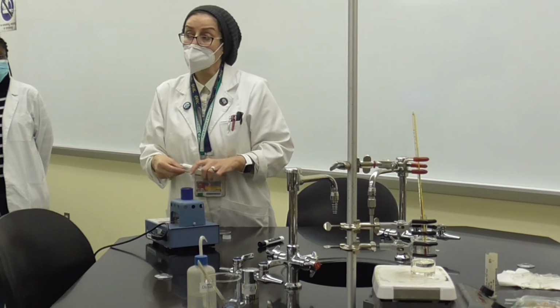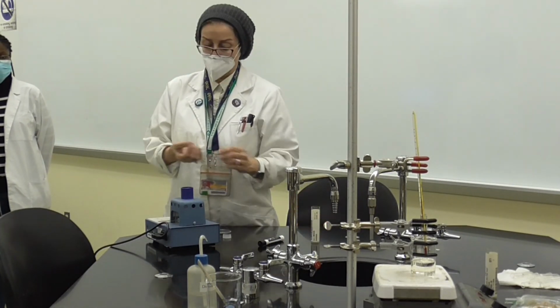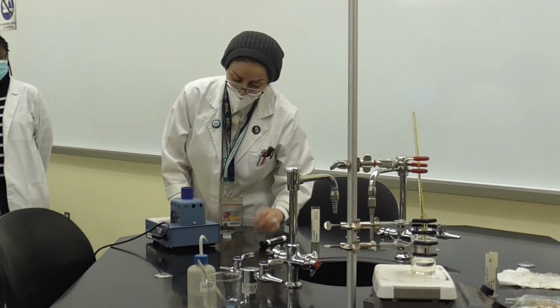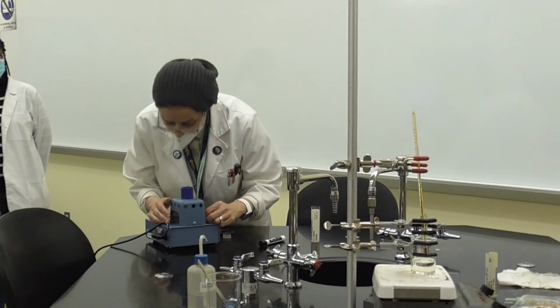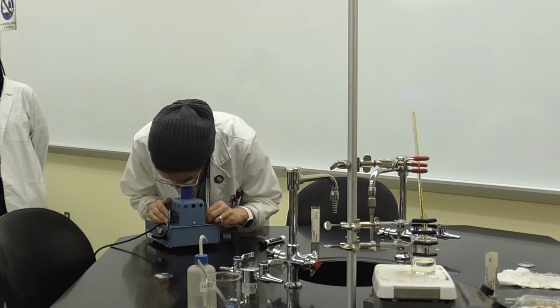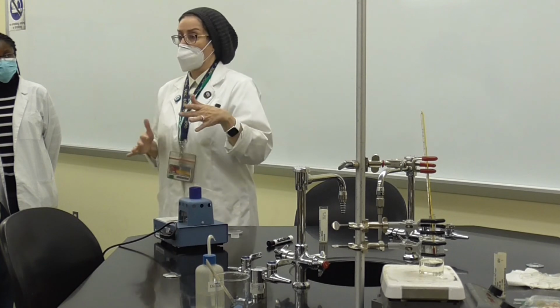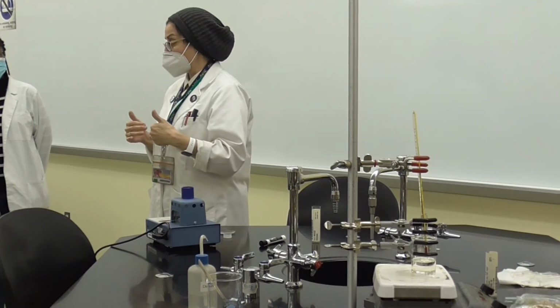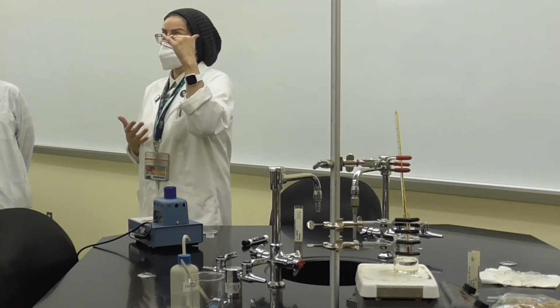You can have the same chemical, or 2 different chemicals. After you pack it and tap it, you insert it over there, and then you look through and watch. Now, we know what we are having, right? We know the expected melting point.